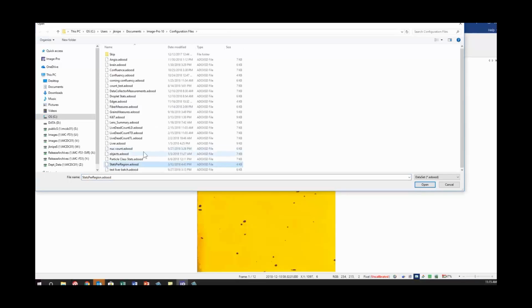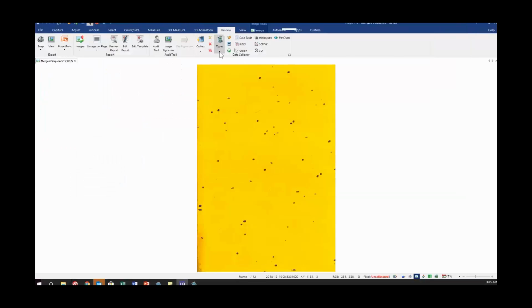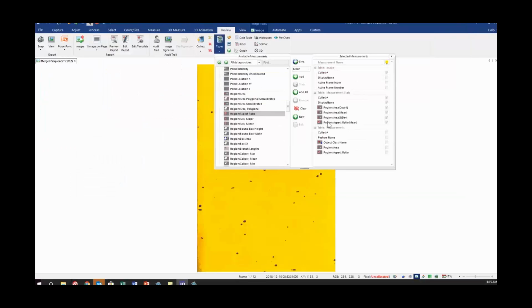Let's see. Just did droplet stats. And this is the one I showed in the PowerPoint. That's set up to collect specific information, statistical information from each frame in essence. And I've turned off, I don't want all the raw data. I don't care about it in this case. I could, if I want all the raw data from all the images, have these turned on.